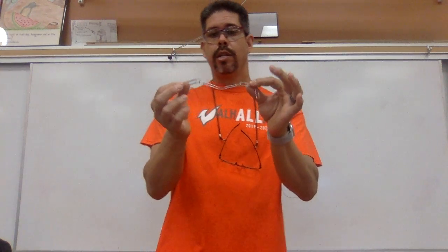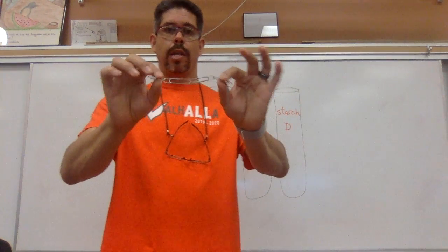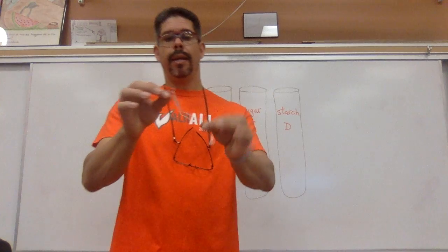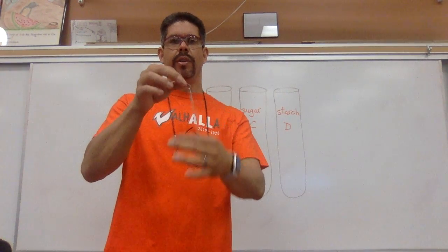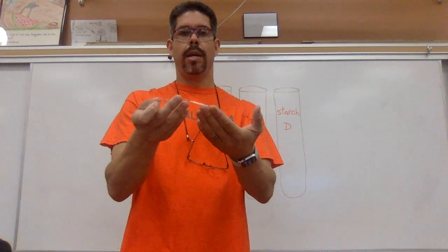So if we pretend that this is starch, that's actually what we're going to test today. We're going to use some iodine. I have some test tubes with some things in there, and we're going to see what it looks like when iodine comes in contact with starch.